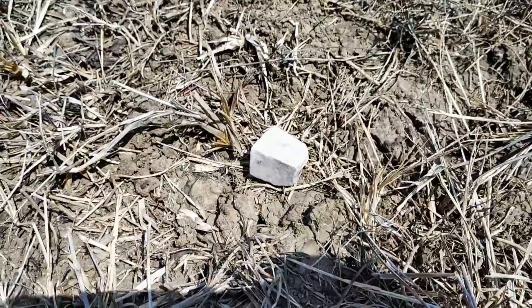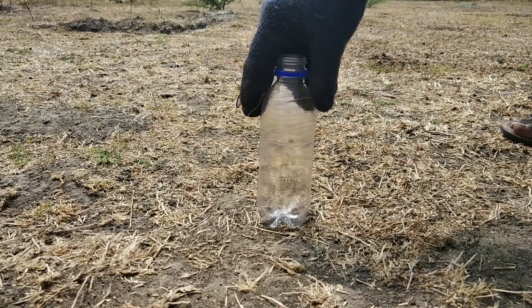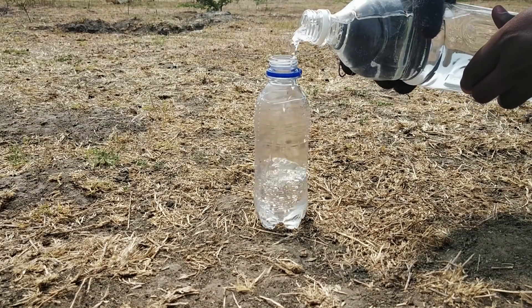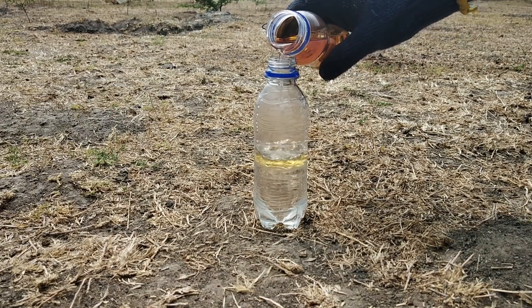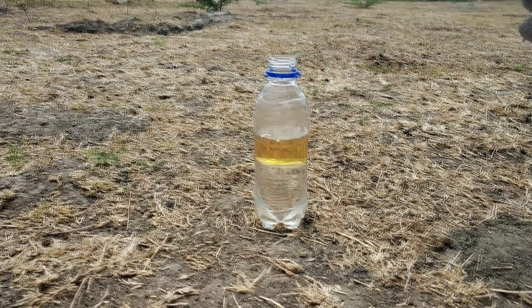Let's try some experiment. First, we have a small bottle. Let's get some fresh water. Now let's put some petrol on it. Let's see if we put any sodium in it. Ok, ready, now let's put the sodium in it.